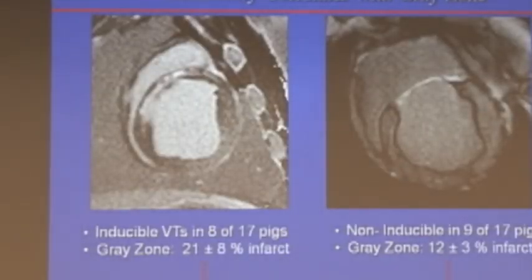A lot of hearts from humans were really not available, and we wanted to do some more detailed electrophysiology. So we came up with a 10-week swine infarct model, where we blow up a balloon in pretty much the mid-LAD in swine and leave it inflated for about 2.5 hours, then deflate the balloon, and they get a nice infarct from that. This work was done by Heidi Essner in our lab, and here are two representative hearts. This heart was non-inducible, and this heart was inducible.